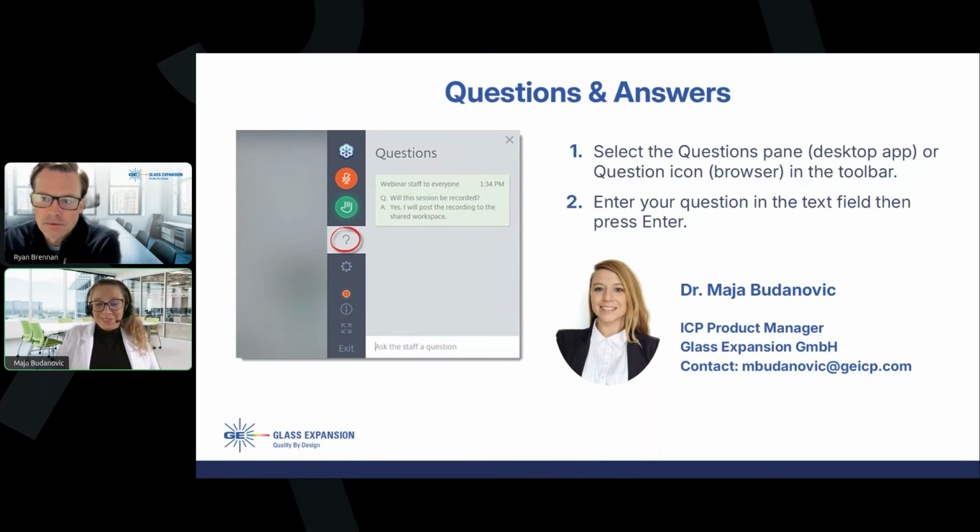Okay, let's start with the torch. When you're looking at the torch, I would first determine, from knowing my sample type and seeing the torch, where I think the deposit comes from. Of course, if it's organic, like a carbon deposit, and you have a muffle furnace, you would just put it under 500 or so degrees for some amount of time to get rid of it. But if you have aqueous analysis, so aqueous types of samples, you can look into whether the deposit is caused by salt.